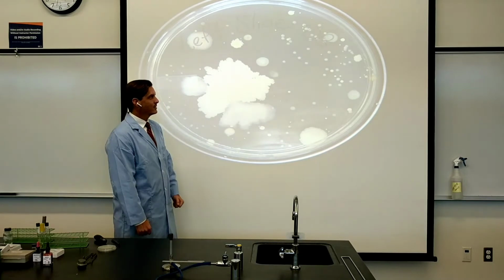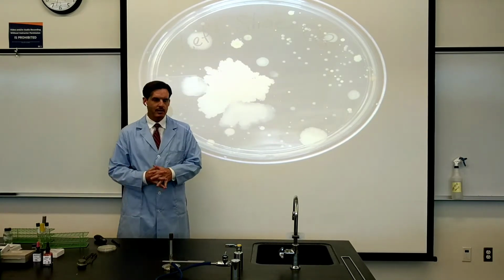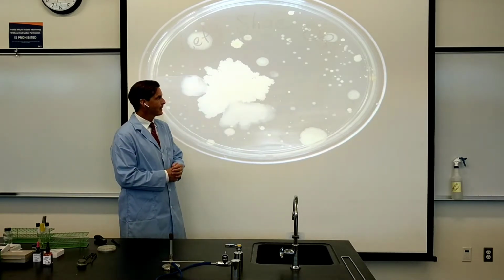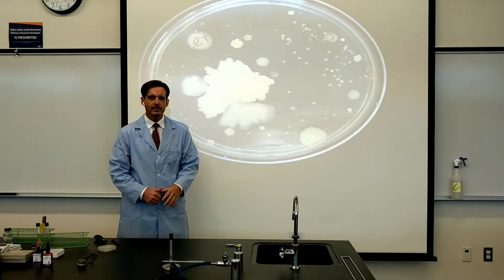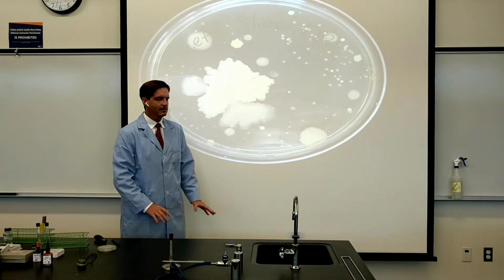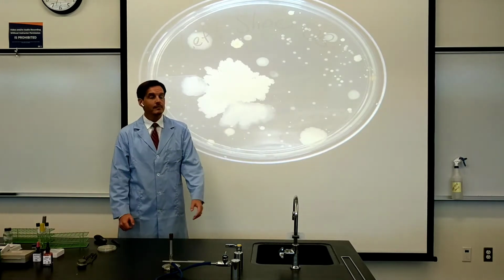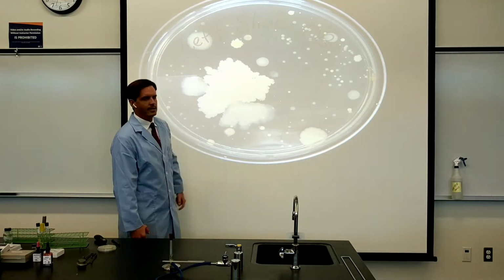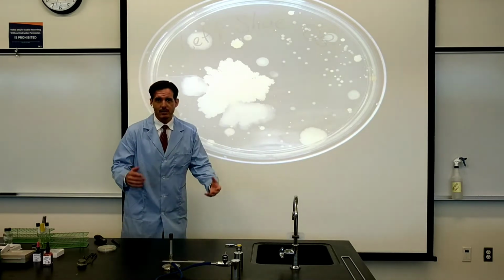no big surprise in one sense that the bottom of my shoe, which undoubtedly comes into contact with a whole bunch of dirt and just whatever's around on the ground. Contamination generally is going to fall down due to gravity, and the bottom surfaces of just about anything in an everyday environment is going to be very contaminated. And you can see the vast array of different microorganisms growing here. And now they're not so microscopic.